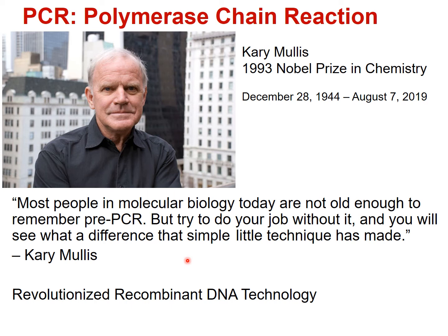When I started, PCR had really just started coming into being used ubiquitously. And I think about the things that I've had to do. If I couldn't use PCR to do them, it would be near impossible. It's not impossible because people did them, but it would be very, very annoying. So this revolutionized recombinant DNA technology.